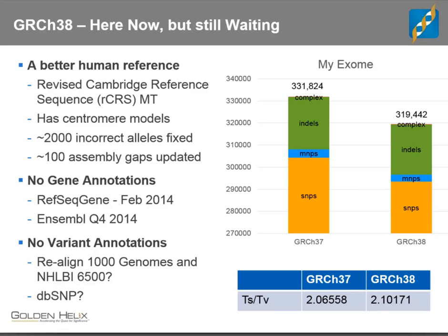Okay, so I touched on GRCh38 a little bit. Long story short, I don't see this as fixing a lot of these issues. At least it is fixing issues, and I have to say that it's a lot of effort and a great thing that we'll be moving to it. It's just going to be a slow and steady process.